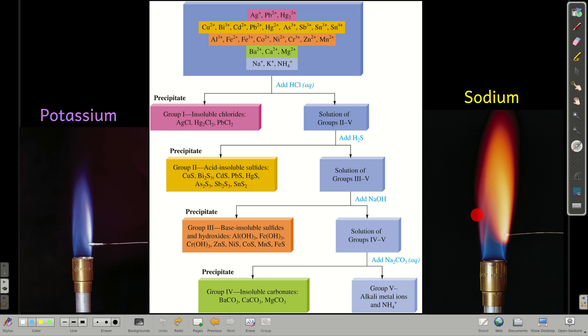All you do is you take a platinum wire, clean it in acid, dip it into the solution and put it into a flame. If you get a flame this color, an orange yellow flame, that tells you that sodium is present. That's real hard to miss.